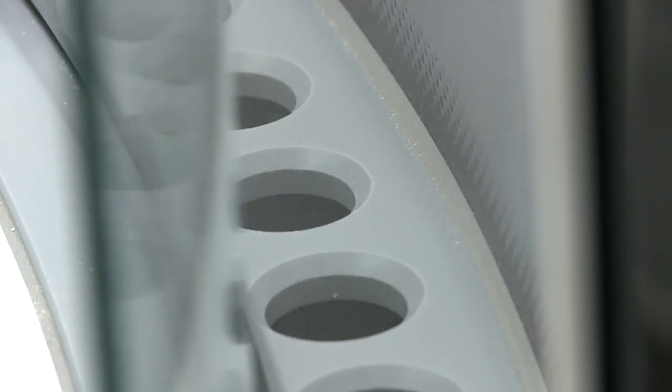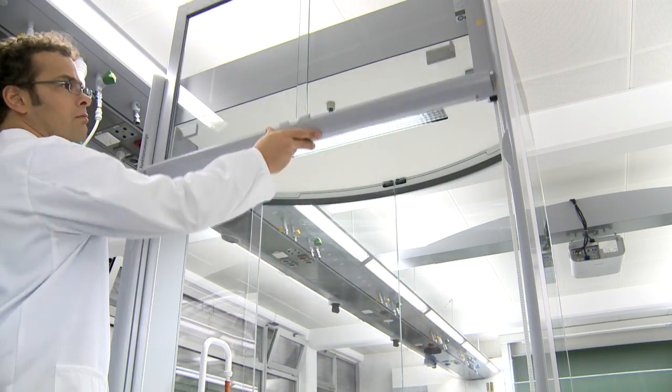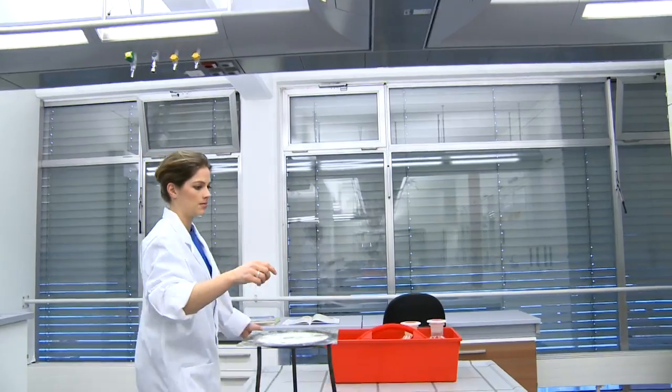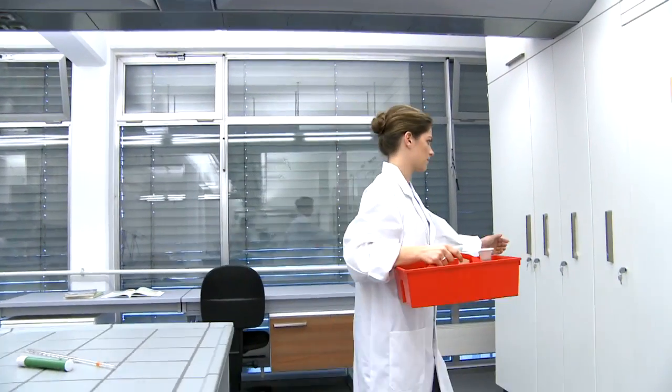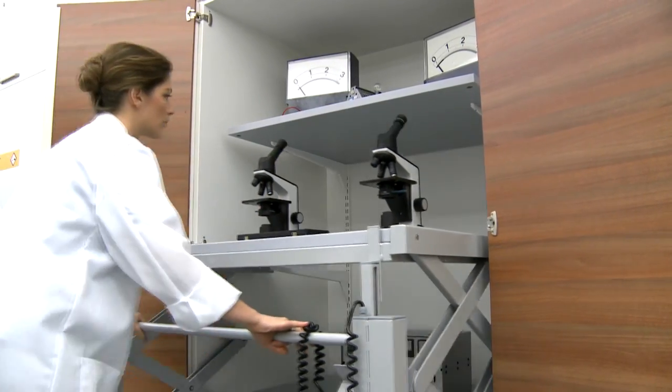Similar benefits also accrue from the optimized exhaust air flow in the Aero-EM mobile fume cupboard. The Waldner Group's sustainability endeavors are rounded off by its efficient approach to production and adaptation of production sequences in line with ecological and energy efficient standards.